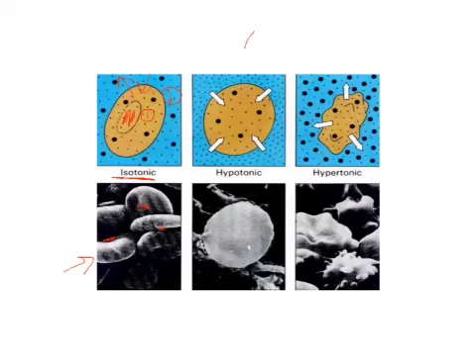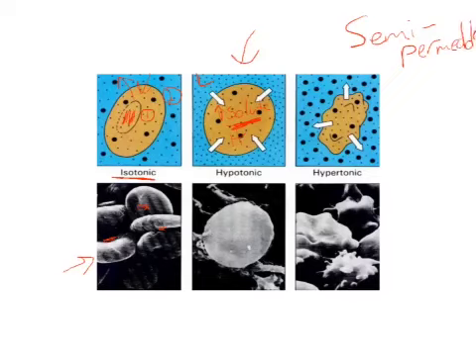In the hypotonic solution, now you have a high salt concentration, or concentration of dissolved solutes inside. Because the solute concentration is high inside and low outside, normally the solutes would move out from high to low, but because the membrane is semi-permeable, that word keeps coming up over and over again, water is the only thing that can move.